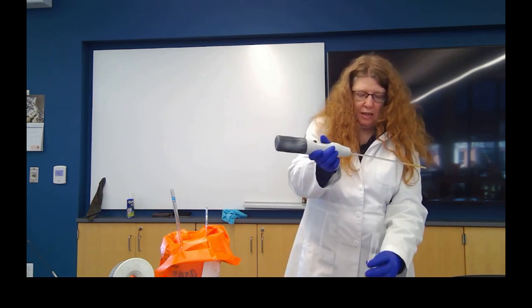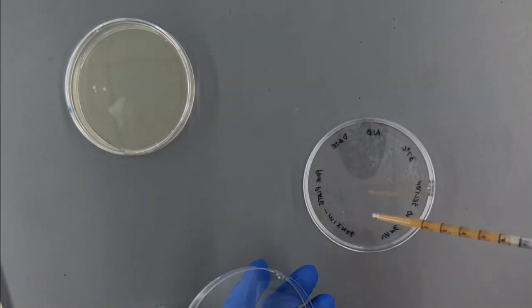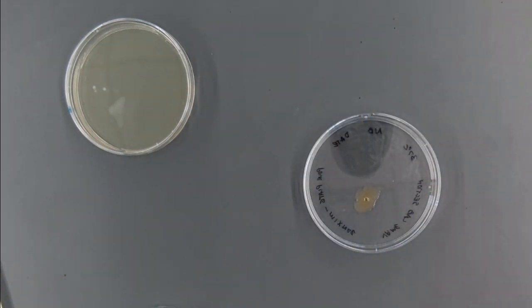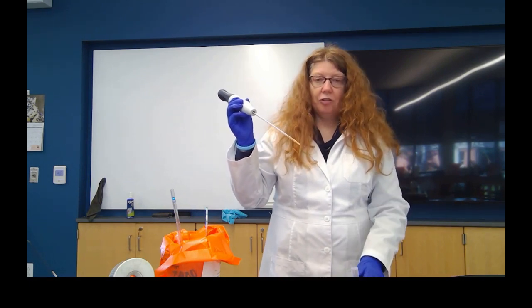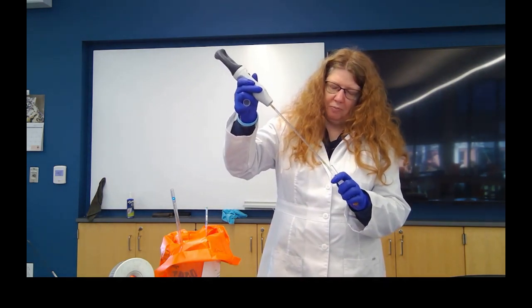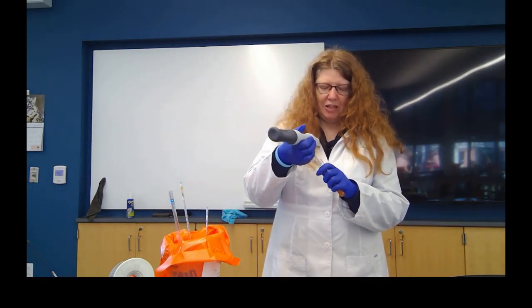So I'm going to recap my tube, remove the lid of my plate, and I'm going to slowly put 0.1 milliliters into the bottom of my Petri dish. Normally, you will not return what's left in here to your sample, but because this is a sterile pipette and it's only touched a sterile plate, everything here is still sterile. It hasn't been contaminated with anything other than the sample. So I'm going to return my sample to the tube. The pipette comes out and goes into the biohazard. And I'm going to recap my tube.